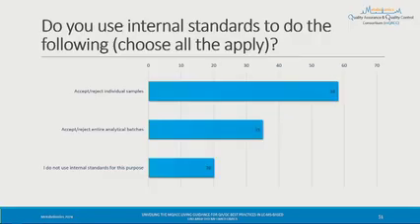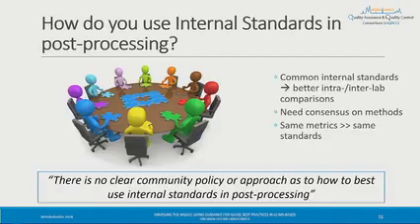And then we asked if they're using internal standards to accept or reject entire batches, and about a third, or 35%, of the community is using internal standards for that purpose. So overall, what we found and what we heard from the discussion is, of course, if we were all using common internal standards, that would be the best. It would lead to better intra-lab and inter-lab comparison, similar to the comment we heard about reference materials.